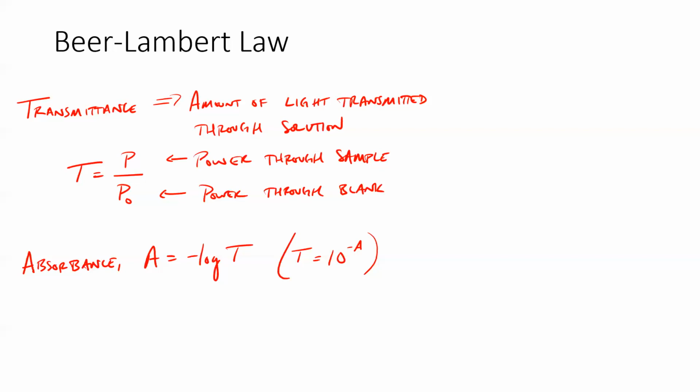And so tying this into what we talked about in the lab last week, that Beer-Lambert law, we know that the absorbance is equal to, I'm going to take it as simple as possible first, and then we'll see the one that maybe we're more familiar with. A is equal to abc. This is a very generic form of the equation. Of course, we know absorbance is big A, little a is the absorptivity, b is the path length, often given in centimeters, but not always. And c is concentration.